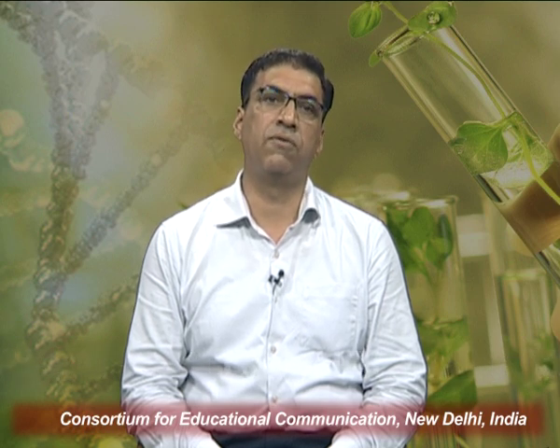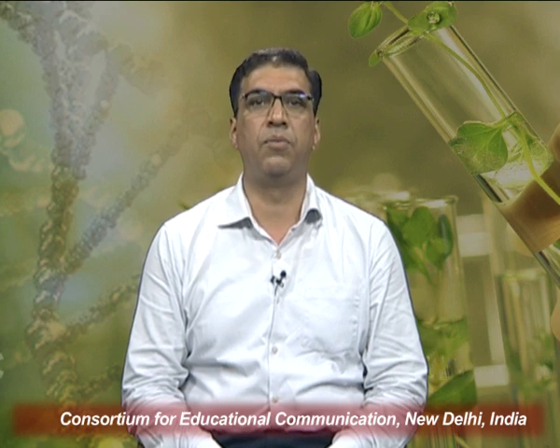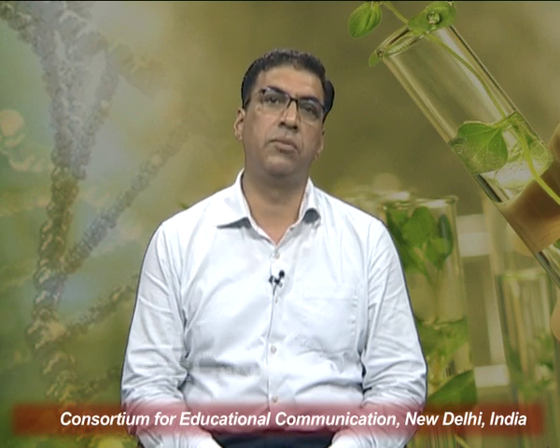Then we discussed the steps involved in the plant tissue culture experiment, starting from the cleaning and sterilization of the glass apparatus, followed by the sterilization of the plant material, establishment of the culture, sterilization of the culture media, preparation of the media, the various components of a culture media, and the function of those ingredients of the culture media.